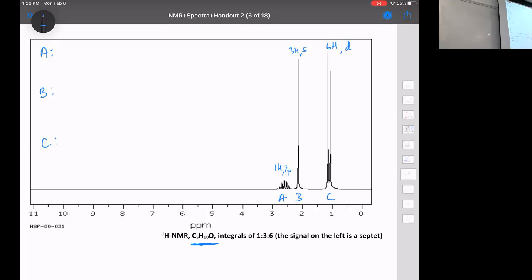This is environment A, and that's environment C. It's okay. You've got the right information here. And so that's next to something, and then you've got CH3 on the top. Okay, that's the CH3. So what is this thing? Right. So what are we missing?